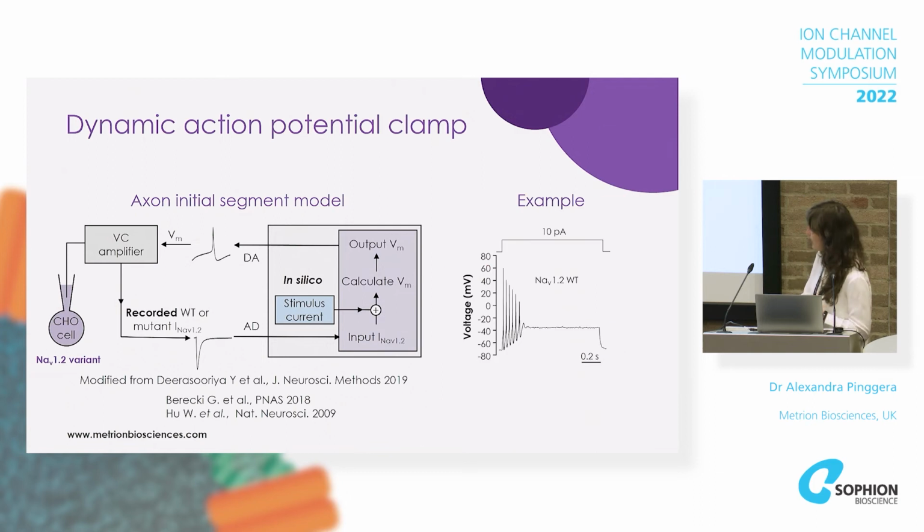To summarize, this is an example. Here we expressed a wild-type sodium channel and did a virtual in silico 10 picoampere current step injection, and this is an example of the firing we would get.